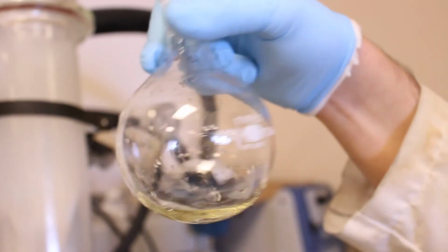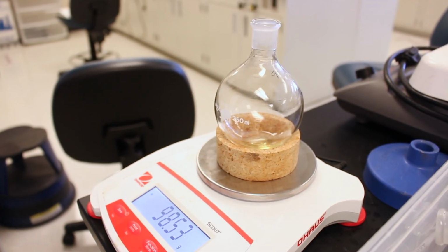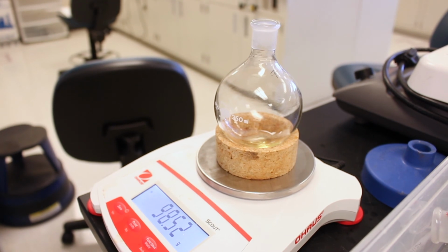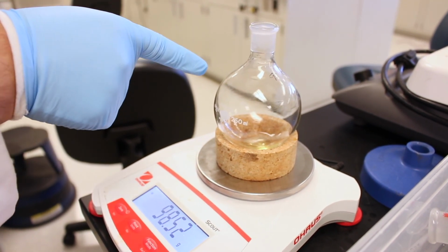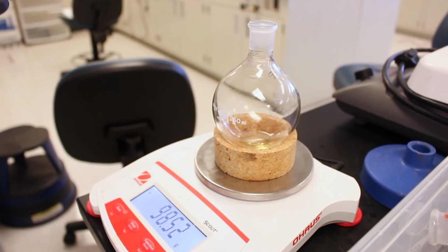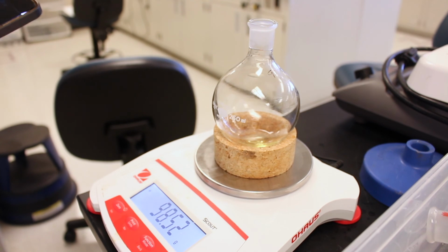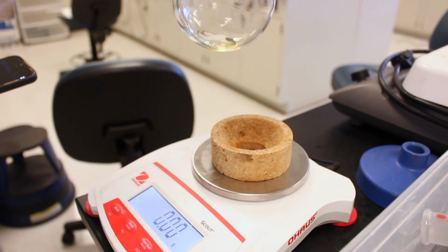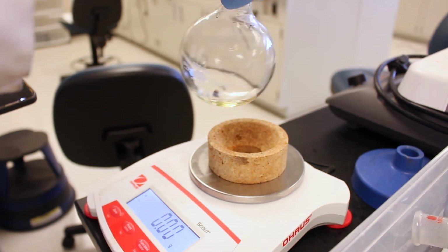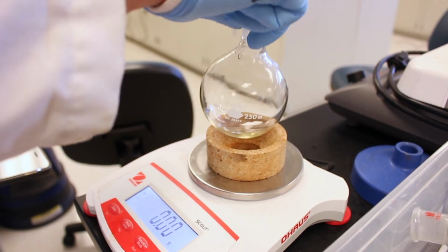We'll figure out how much we got. So we've got our flask full of eugenol on our balance here, and the mass it's giving us is 98.52, and we'll subtract that from the mass of the flask, which was 97.28, which gives us a final mass of 1.24 grams. So that's how much eugenol we got from this experiment, and we'll use that in next week's lab to methylate it and do our biological activity.